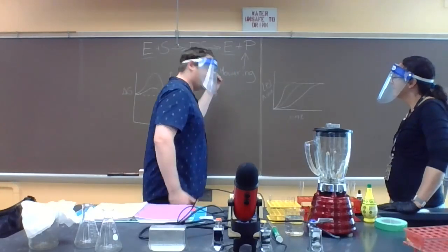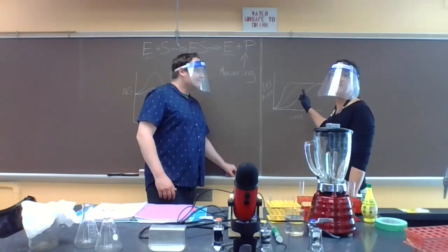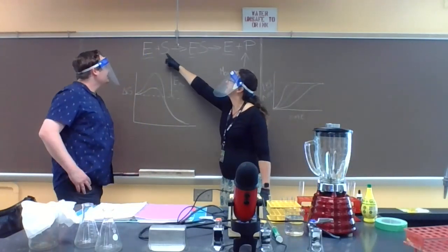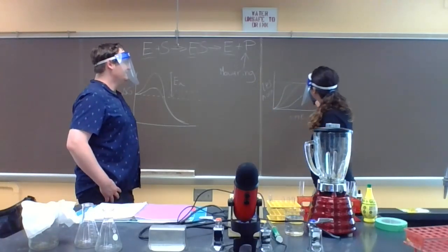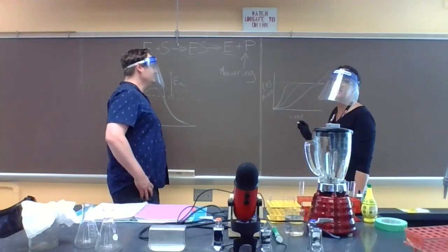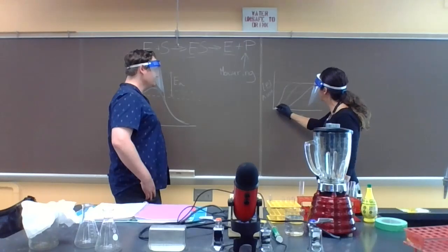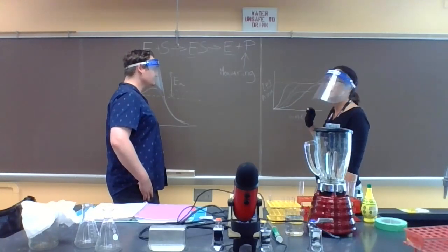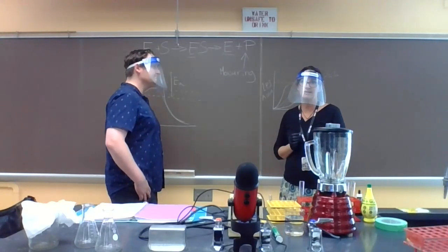And I think that covers all the background that everybody needs. Well, I just wanted to show what happens if you add less substrate, though. Oh, that's a good question. In the second part of the experiment, we're going to lower the concentration of the substrate. So then what will happen is the steady state that you reach, if this is our steady state here, that is going to be lower when you lower the amount of substrate. So maybe when our reaction goes up, we're only going to reach a level over here. So it will be lower than the steady state with a higher concentration of substrate.